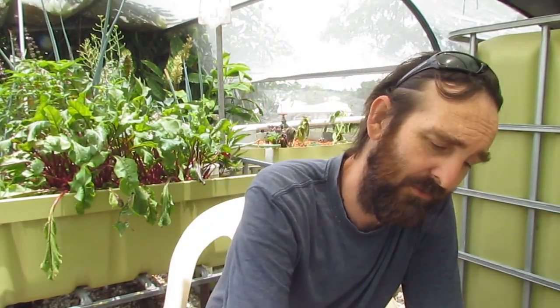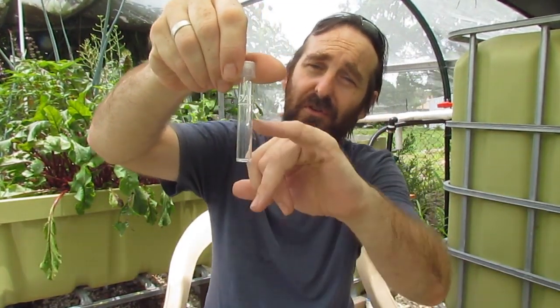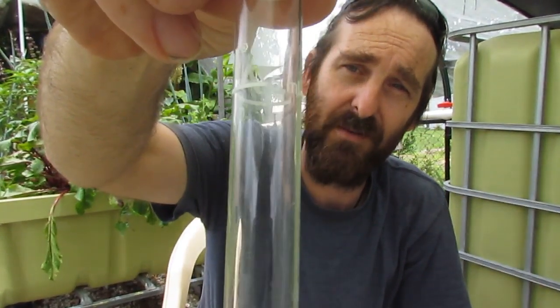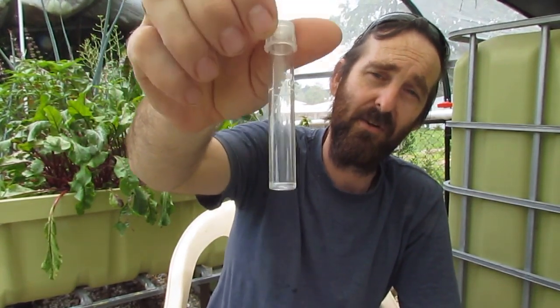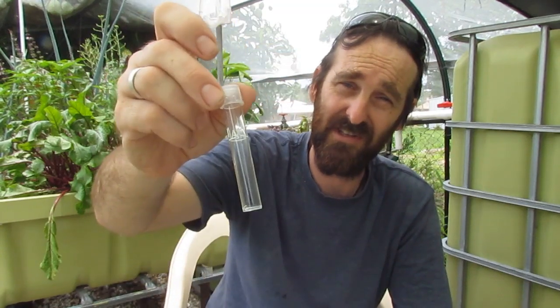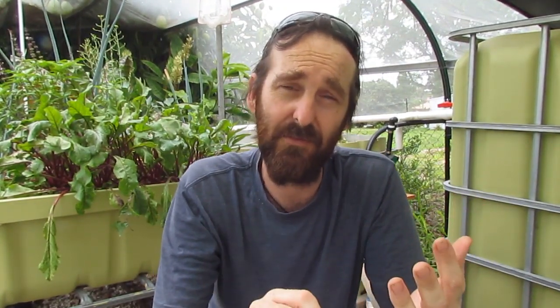To begin with, what we do is fill up these little test samples with water to a little line here — that line indicates 5ml of water. I've actually rinsed these test tubes out with the water from the aquaponics so we're going to get as true a reading as we can. I don't want to use any detergents or other chemicals in there because it may skew the reading. I take the water samples from the water coming directly from the fish tank, so that should give us the highest readings of ammonia available — that's the one we're worried about in terms of fish health.